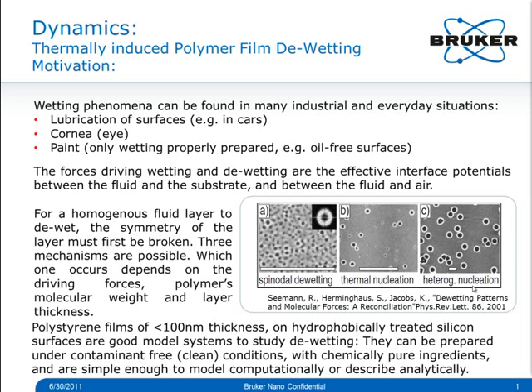Spinodal de-wetting occurs when the heated film forms surface waves, which amplify over time if the interface potentials favor that, until the wave amplitude exceeds the film thickness. Because of this mechanism, one can see waves early in the process and linearly grouped holes in the later stage.